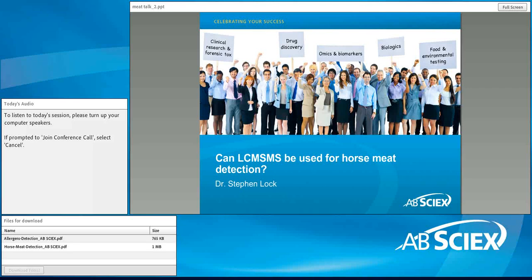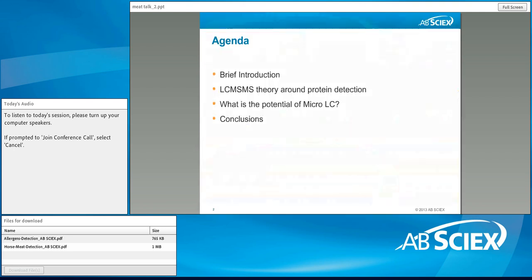And when this happened, I had discussions internally about whether we could use LCMS to develop a method not only for detection of banned vet residue which are used in the racing of horses, but also in the detection of speciation or horse meat itself. And this is what drove me to the slides and data that I'll show today in this webinar.